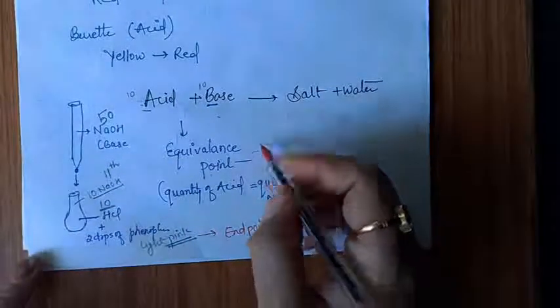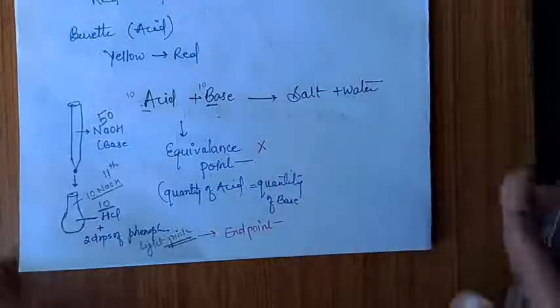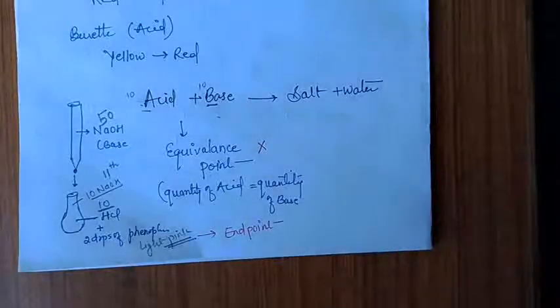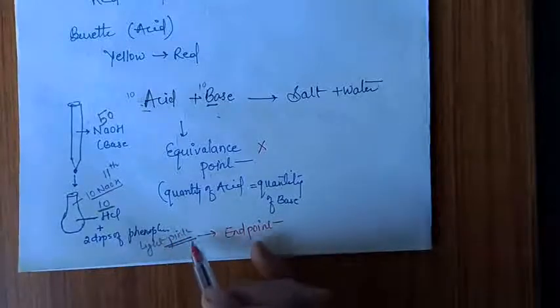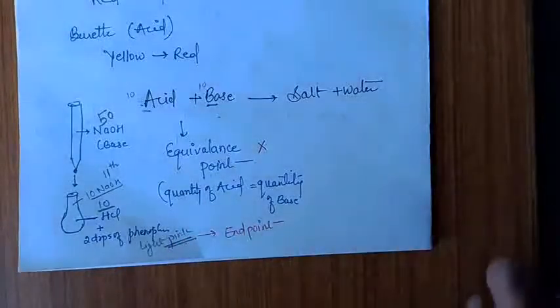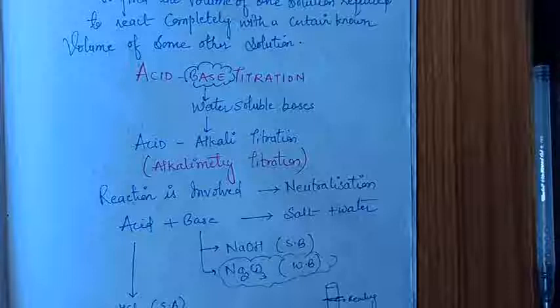So equivalence point you never see, you cannot see, but you may consider the equivalence point was there just one drop before you get the light pink in the titration. So this is actually the condition that how to understand reaction is complete.